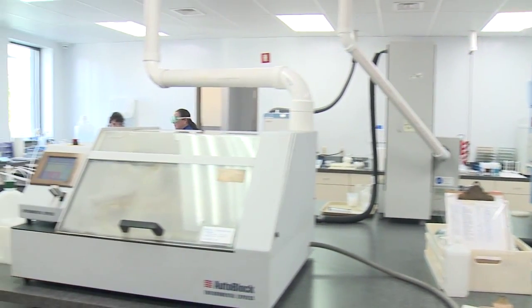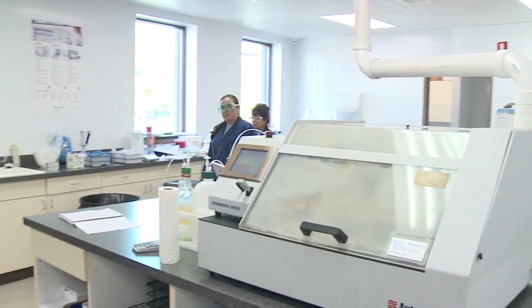Would pineapple slices be in there, or does it come in as pieces of dehydrated clay? Yeah, we would actually test pineapple. Really, anything you could think of. Makeup you put on, sunblock, suntan lotions. For the SPF factor, we would test those.